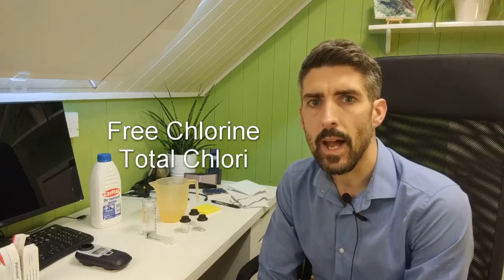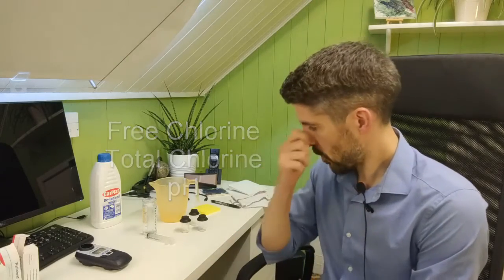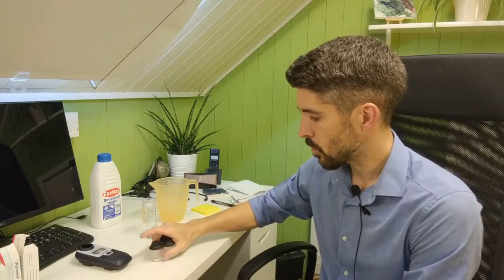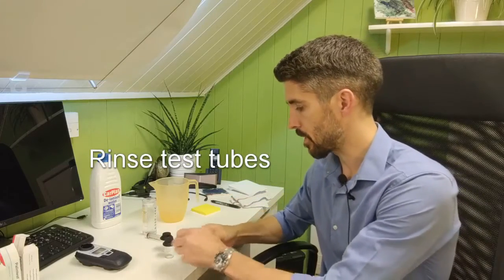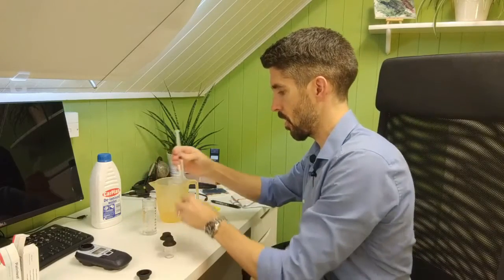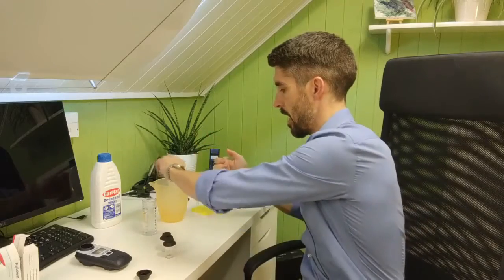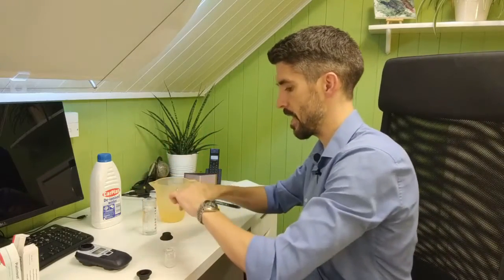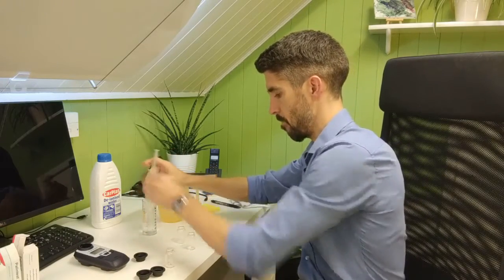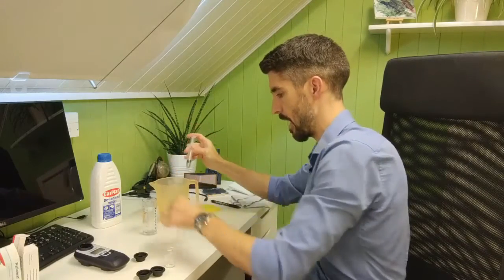What I'm going to go through in this video is how to use a Pooltest photometer to test for free chlorine, total chlorine and the pH value. So to start off with, what you need to do is rinse your test tubes out. Now I have already rinsed these out, but I'll do it again anyway, because it's important to get rid of any residue there may be in the test tubes from previous pool tests that might interfere with the result that you get.